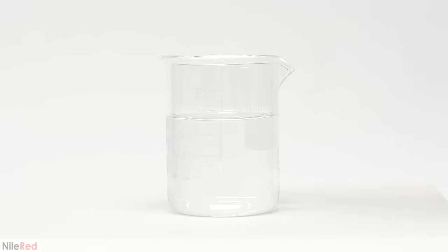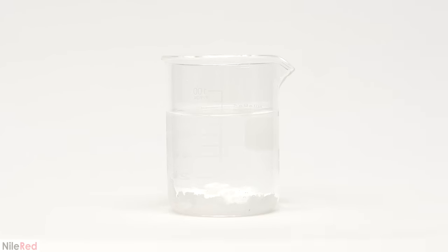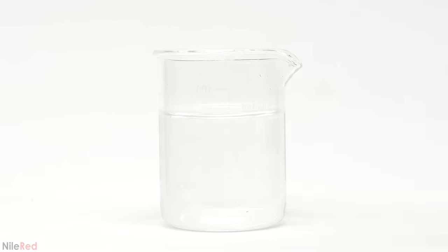To get things started, I just need to make a solution of lead acetate. I weighed out 10 grams, added it to 80 milliliters of distilled water, and then mixed it until everything dissolved. It's important to use distilled water here because minerals in tap water can sometimes react with the lead acetate and make a cloudy solution. It all dissolves after about a minute of stirring, and now I'm ready to add the zinc.